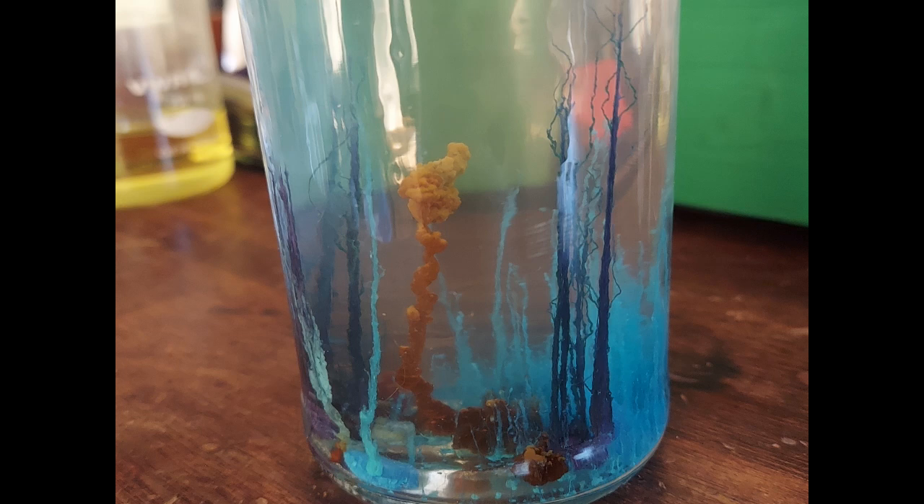Hello everybody and welcome to the Poor Man's Chemist. In this video we are going to be playing around with the famous chemical garden experiment, which you can see on the screen.